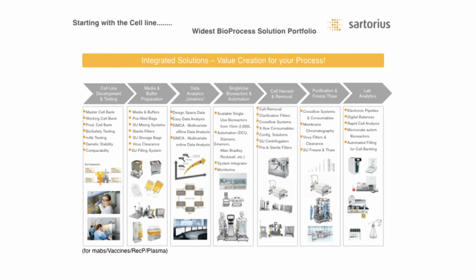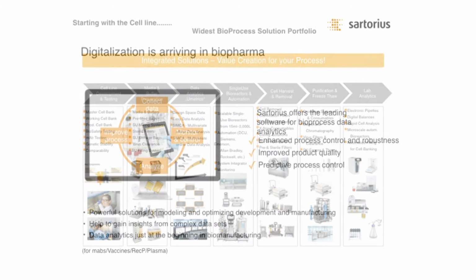are developing and banking. The piece I'd like to focus on is how we apply a data analytics platform to the process data, to the conditions of culture, and then to the analytical and characterization data that we're gathering as we go through the production process.